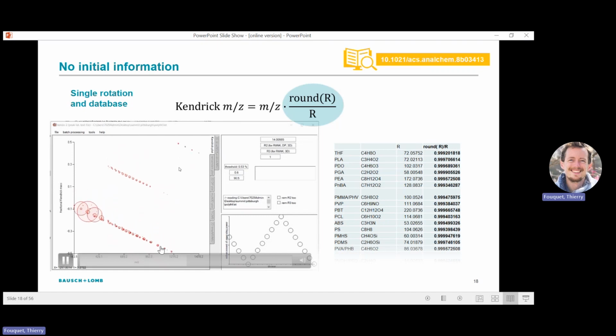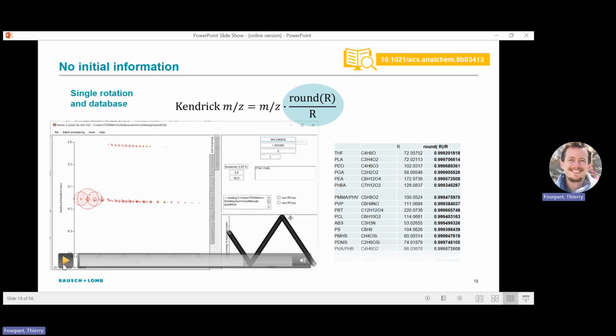But of course, this is no more flat, so this is, of course, no PTFE or no PVP and so on. It's flat here. It can be poly-THF or PA69. To choose between the two, I can test them. I'm testing PA69 here. I got that plot. That's my static plot.